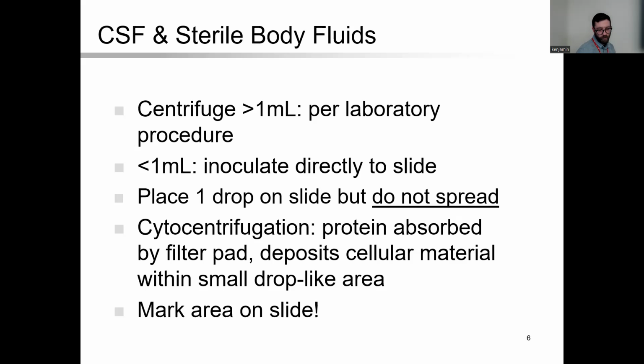So the bacteria that we're looking for will be spread out inside that little hole. What's important about this is you really want to mark that area on the slide with a glass cutting pencil or something. Oftentimes CSF is fully clear. If you don't mark your area on the slide, you're not going to know where you're looking or what you're looking for.